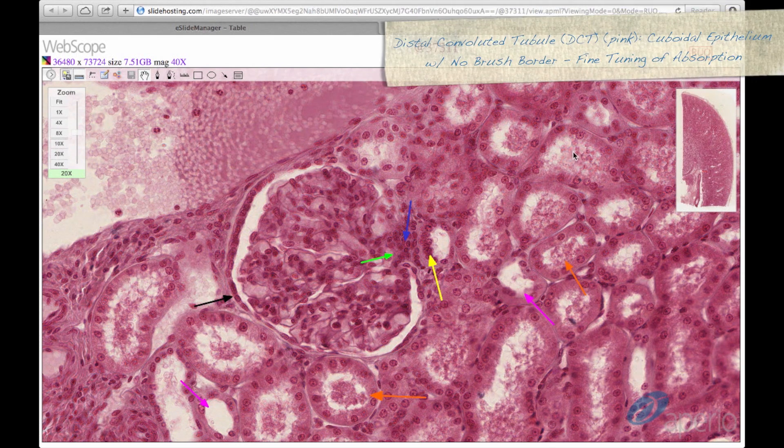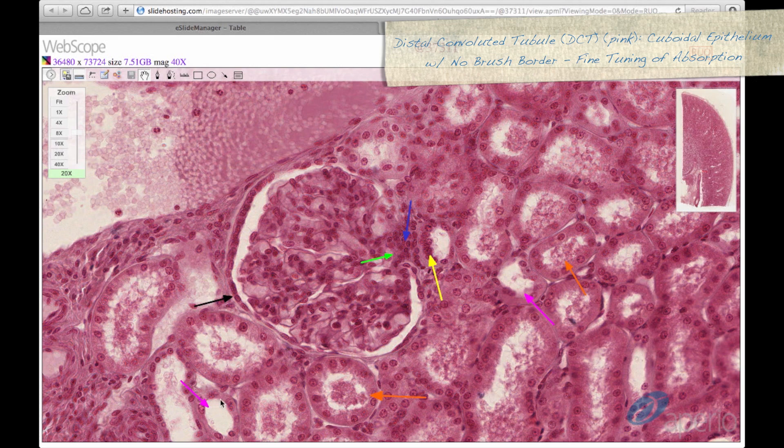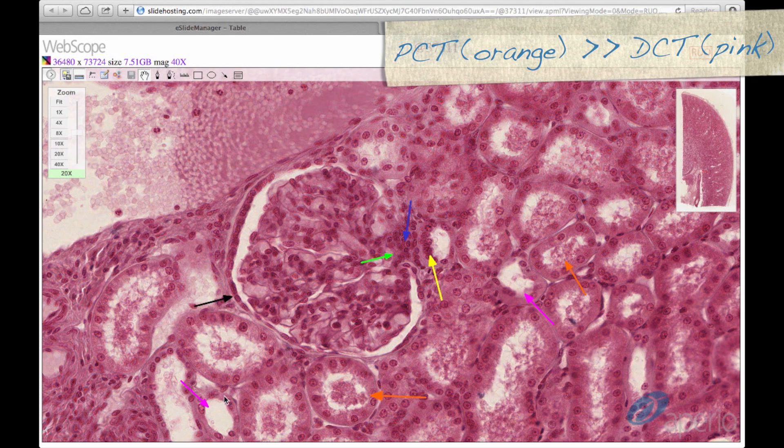We can also see the distal convoluted tubules here at the pink arrow. These are for fine-tuning of absorption and do not have a brush border. They also have cuboidal epithelium. The proximal convoluted tubules greatly outnumber the distal convoluted tubules.